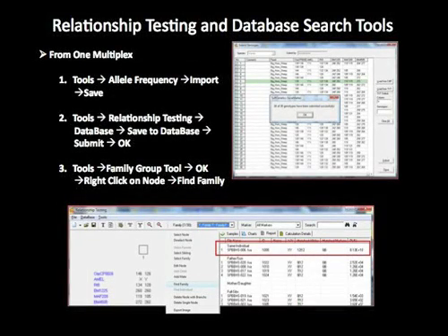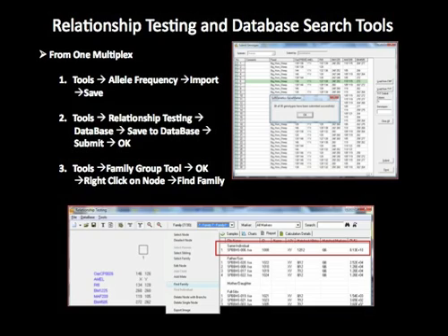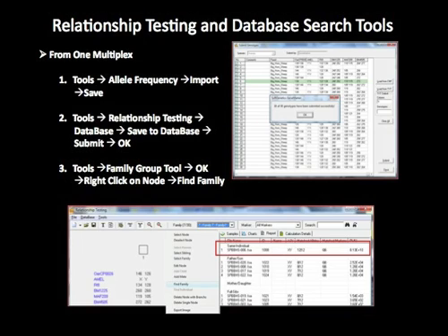GeneMarker's relationship testing and database search tools search the database for identical samples and potential relatives. The program uses identity by descent calculations to provide a likelihood ratio for each positive match and rank files as to the most likely that they share a given relationship level versus that they are unrelated. First, let's look at the results from one of the single multiplex projects in the database search. After opening a project in the main analysis screen, use Applications, Relationship Testing to open the relationship testing screen. Select Tools, Allele Frequency, Import, and save to provide the program with the allele frequency table for your population. These allele frequency tables are saved in the database and available from the drop-down menu for additional analyses later.